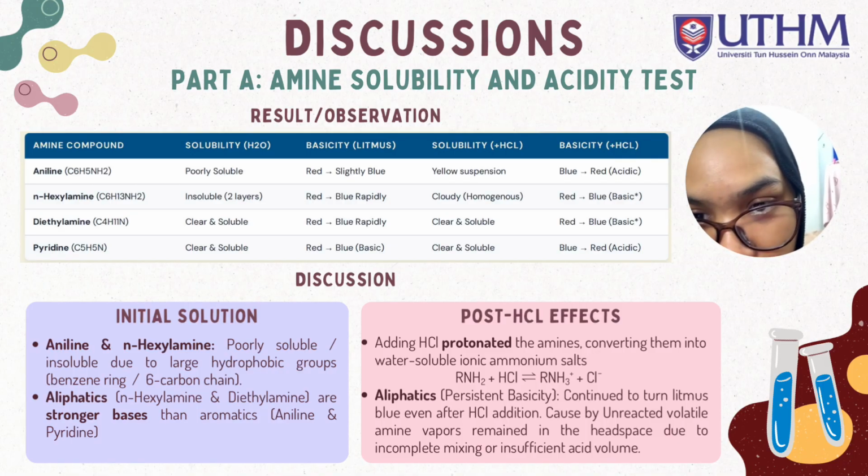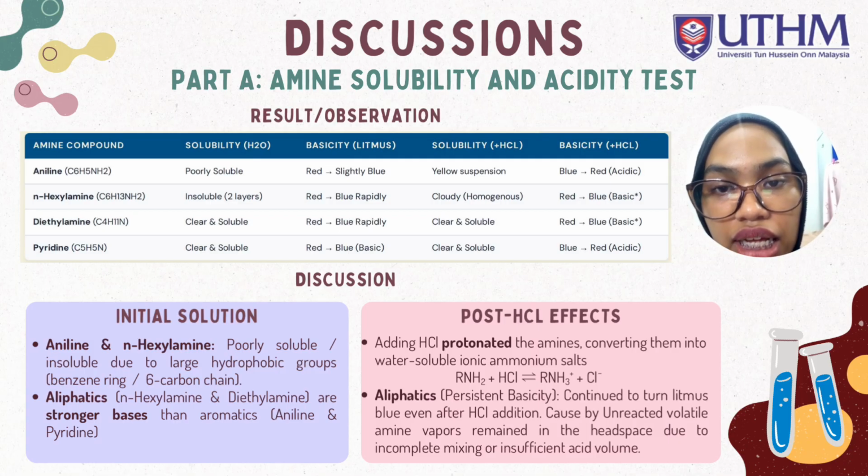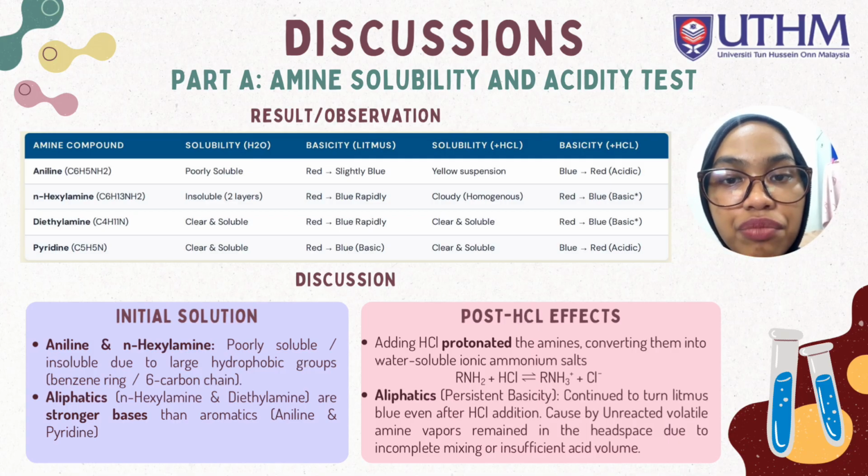The last compound is pyridine. Solubility in H2O is clear and soluble. The basicity is red, turns blue, basic. The solubility in HCl is clear and soluble. The basicity is blue, turns into red, acidic.